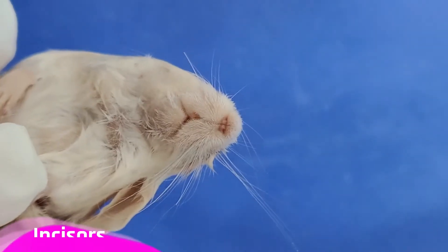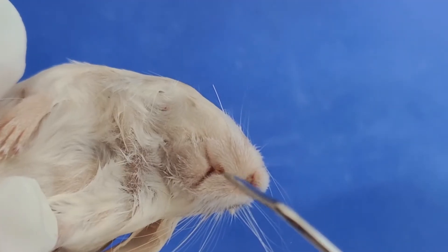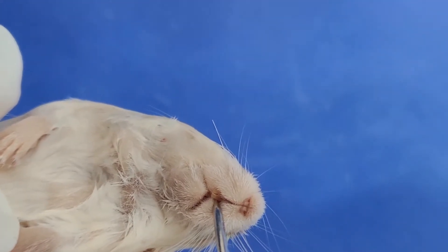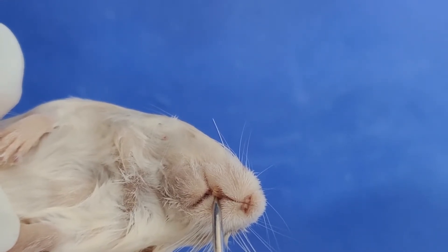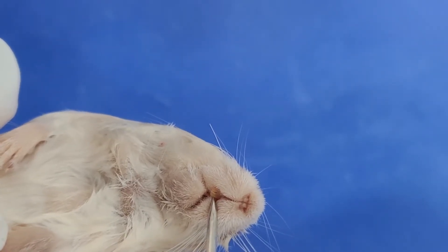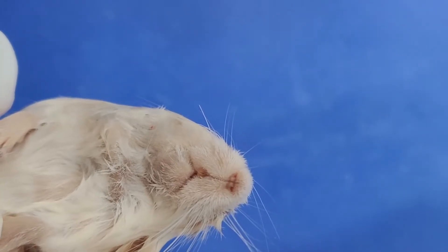Next, here are these large incisors. Mice are gnawing animals, and these incisors are continuously worn down. Because of this, the incisors will continue to grow for as long as the mouse lives.